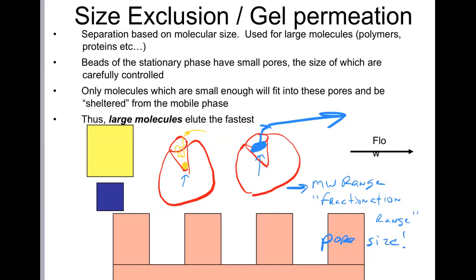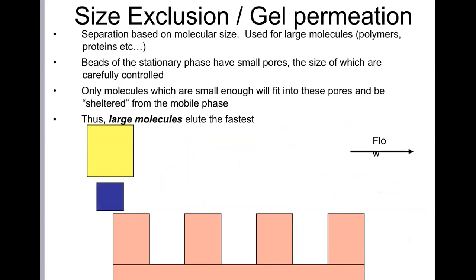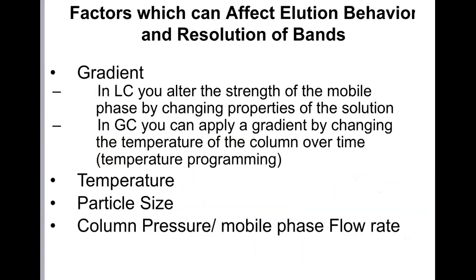Now, the really cool thing that I love about size exclusion chromatography, I think this is really neat. It turns out that if you're working in this fractionation range, you can run standards of known molecular weight on your column. Get your chromatogram, and if you can assign each peak in that chromatogram to a known molecular weight, you can then run an unknown sample that you don't know anything about and estimate what the molecular weight of unknowns are just by their retention behavior. You just compare them to the standards, and there's a way you can estimate the molecular weight. It's really, really cool. You don't need any fancy equipment. You can just do size exclusion, okay?